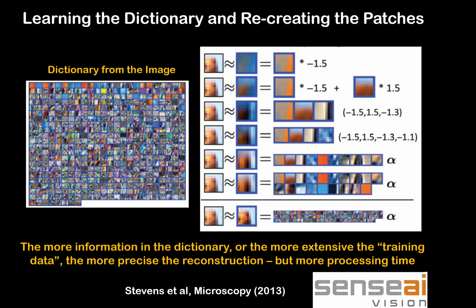That will allow us to get the biggest dictionary that we can to be able to reconstruct our image. And we want that image to be reconstructed with no loss compared to the fully sampled image. And that's the process of the sensing and the reconstruction that comes out with the compressed sensing algorithms.